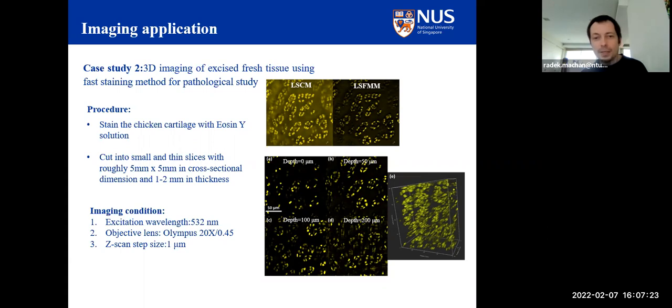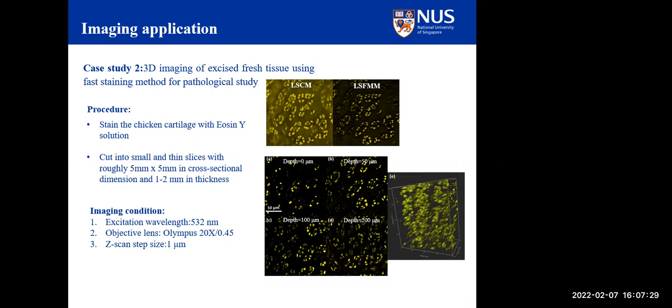Okay, any other questions? I just had one other question. I know with some other microscopes, for example a lattice light sheet, depending on the sample you're using, there can be a really large amount of troubleshooting and optimization to get it to do what you want.